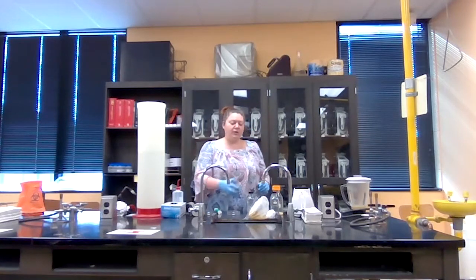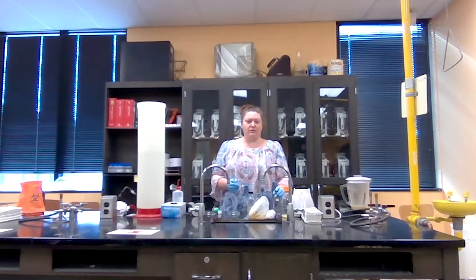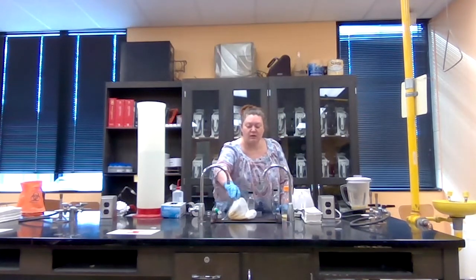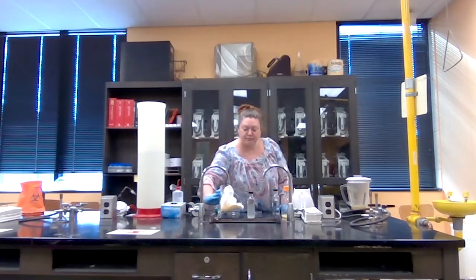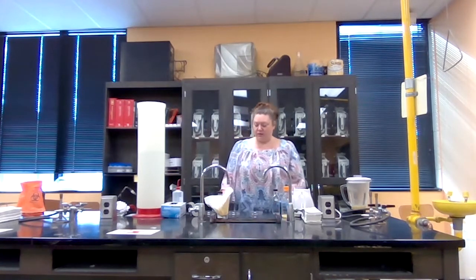Okay, so whenever I'm running an experiment, I always like to run a negative control to make sure that everything with my experiment is running the way that it should be. So with my negative control, I use sterile water in the place of the Taco Bell taco solution to put inside of a petri dish. So I'm going to see if I can move this over a little bit. There we go. And hopefully you'll be able to see from over there a little bit.